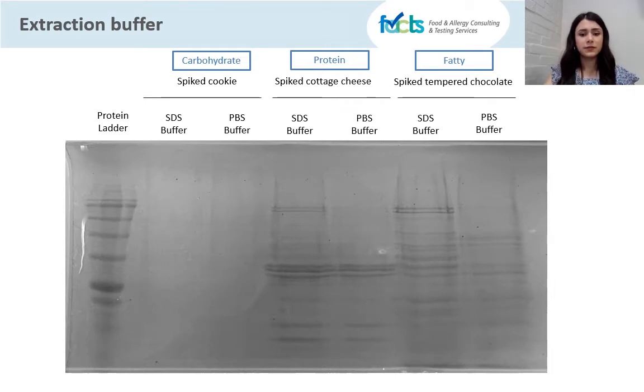We were unsuccessful in obtaining protein from the spiked cookie and thus excluded this matrix from the experiment. We suspect that the flaxseed ingredient might have caused protein aggregation to take place, a phenomenon we have seen with the closely related fenugreek seed. We plan on exploring this further.